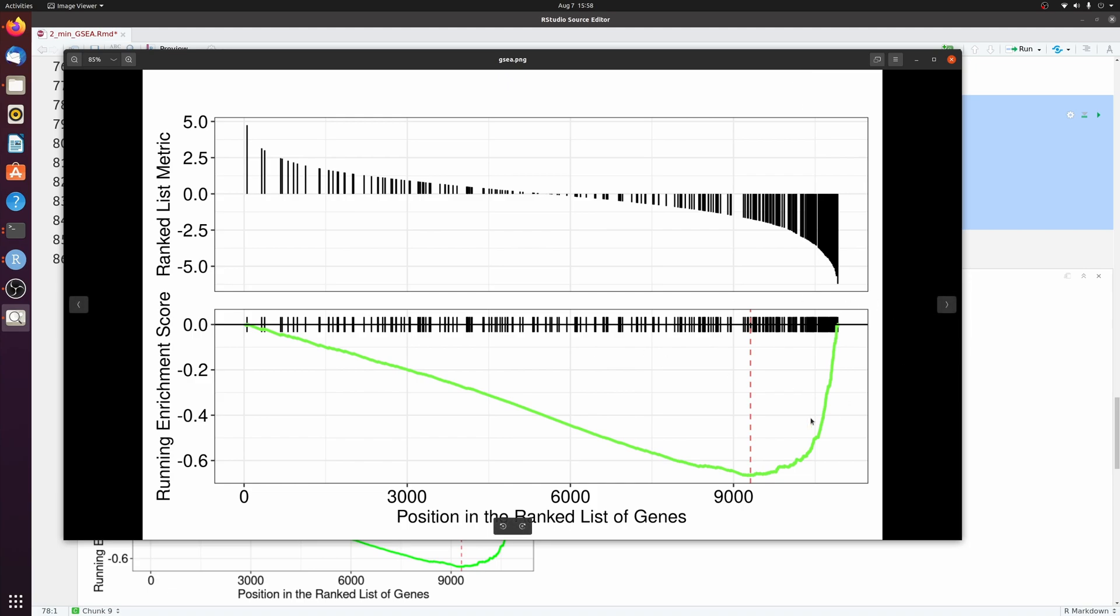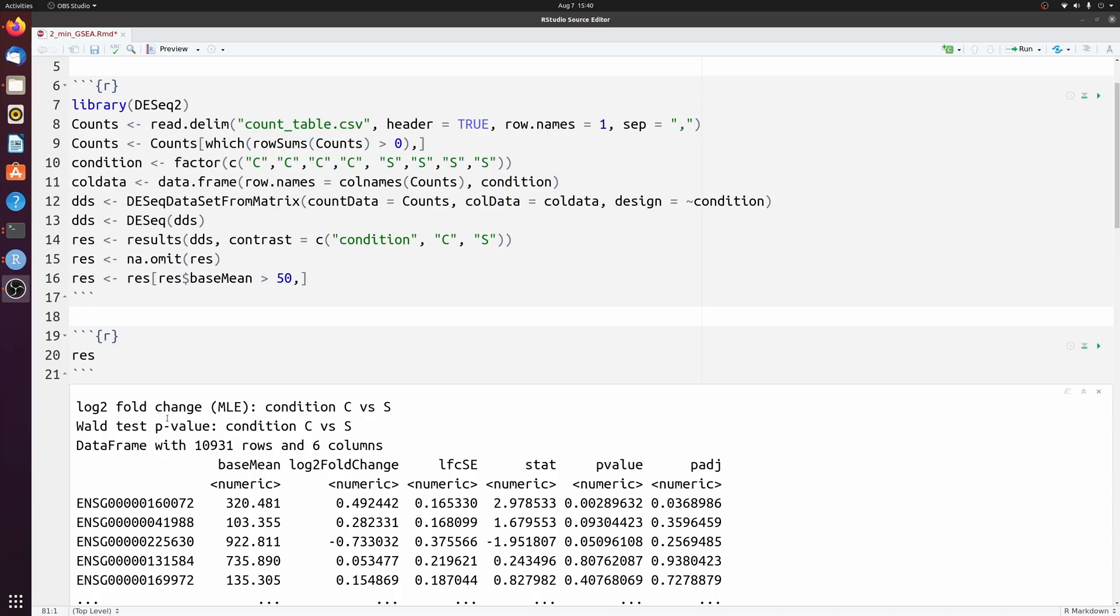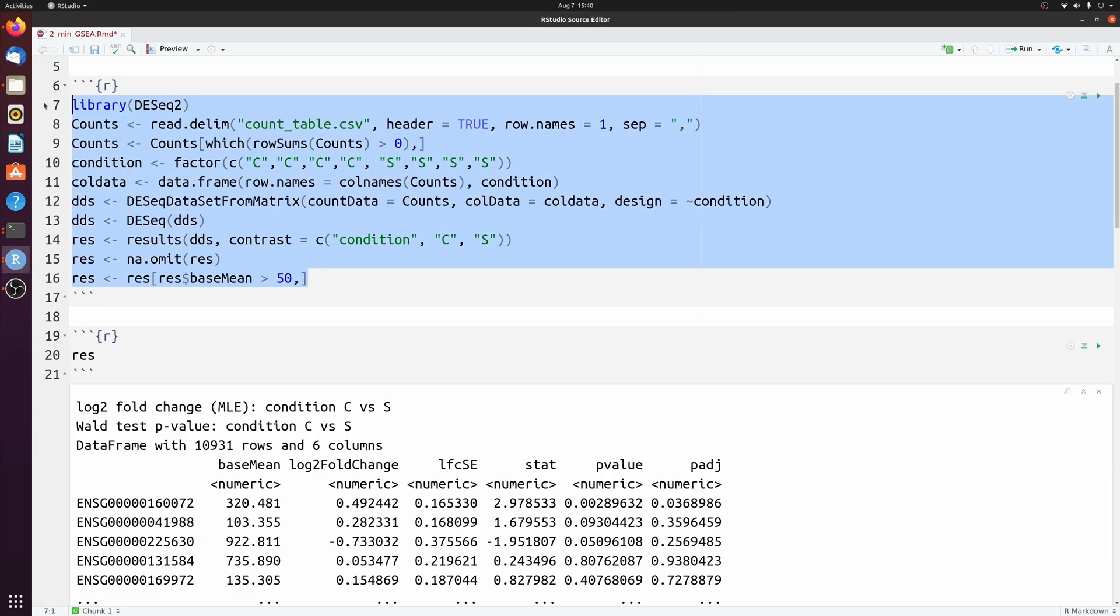In the end, you get this nice-looking GSEA plot. Alright, I'm going to be running this on DESeq2 output. I've done just a really simple differential expression analysis.